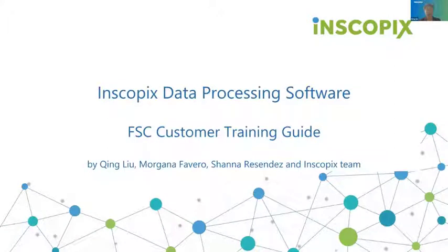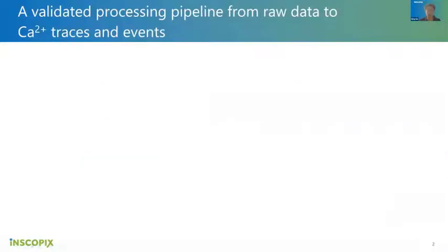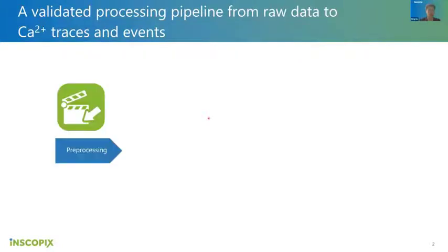Yeah, we start with the general workflow. Everybody is familiar. Let me start. Let me go to pointer. Yeah, general workflow for the data processing: how to get from the raw recording to the events you need to extract and compare between different conditions.